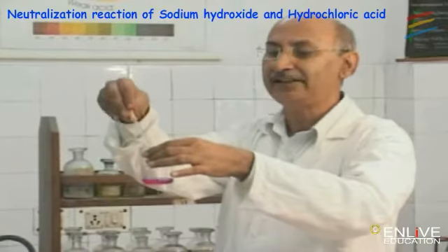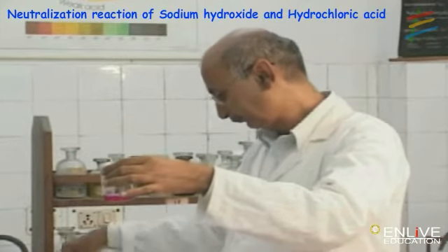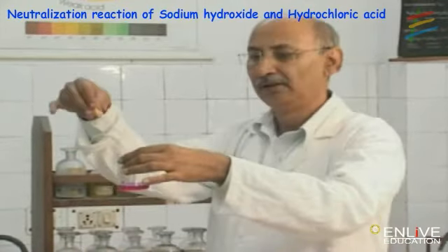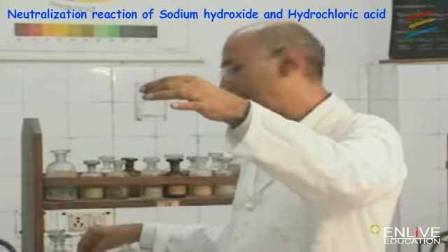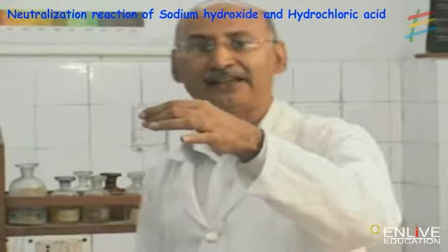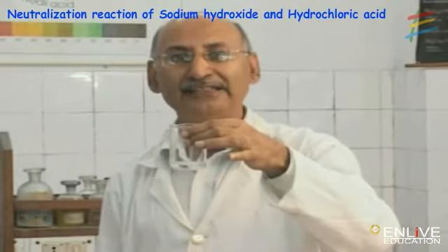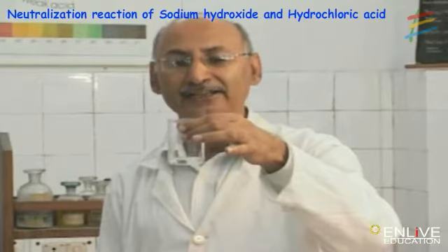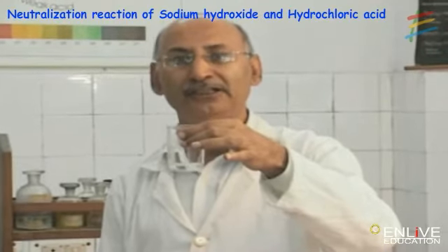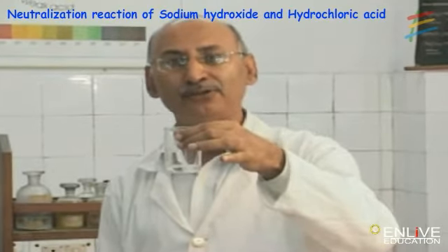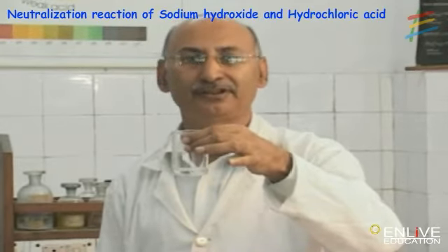This means more HCl is needed for neutralization of NaOH. We are adding more HCl and slowly the color will disappear. It means that HCl has neutralized NaOH and forms NaCl and water. NaCl is neutral, therefore the color of phenolphthalein has changed from pink to colorless. This shows the neutralization reaction.